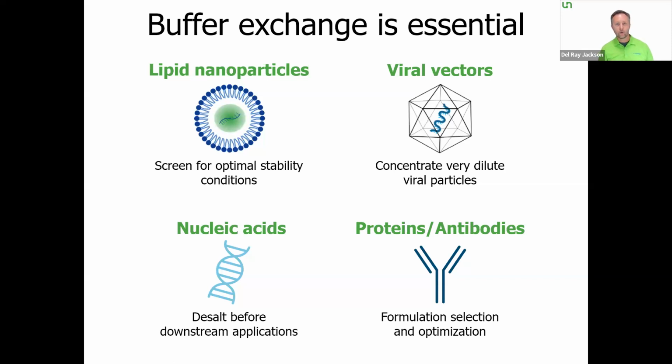And in doing so, you'll know that buffer exchange is one of those tasks that's really essential. We make these different biomolecules: lipid nanoparticles, viral vectors, proteins, antibodies, nucleic acids. And typically, the buffer that they're made in has to be exchanged for various reasons. For LNPs, we know that ethanol, typically you want to remove that quickly, or you're just screening a lot of different conditions for stability on your LNPs.